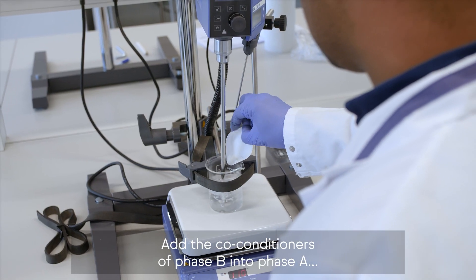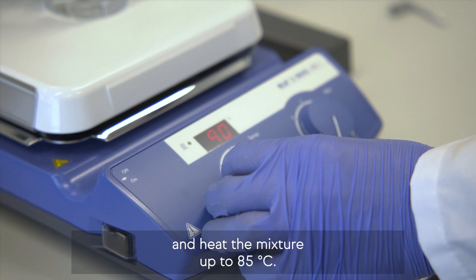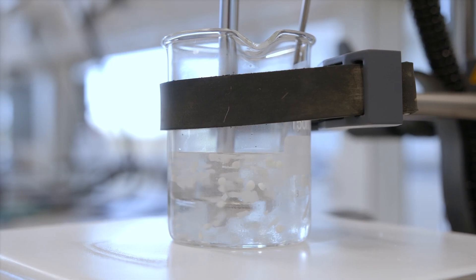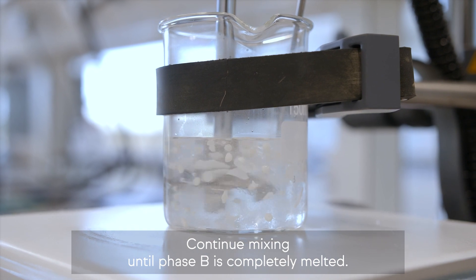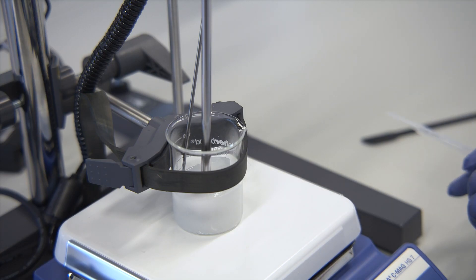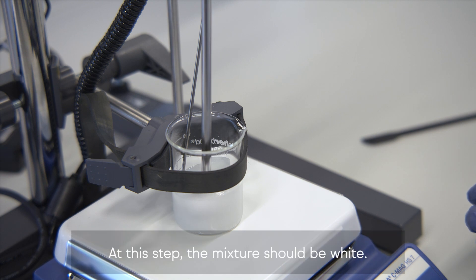Add the co-conditioners of Phase B into Phase A and heat the mixture up to 85 degrees Celsius. Continue mixing until Phase B is completely melted. At this step, the mixture should be white.